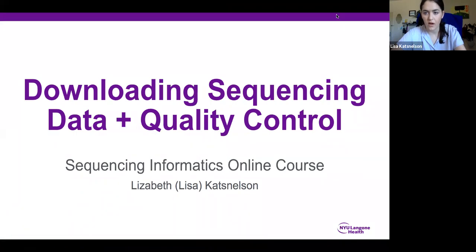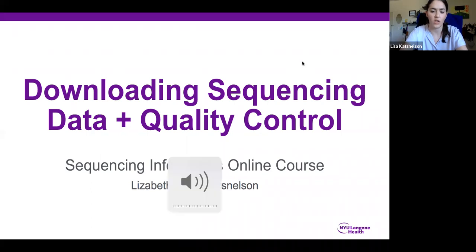All right, hi everyone. My name is Lisa, and I'll be talking today about downloading sequence data and quality control.